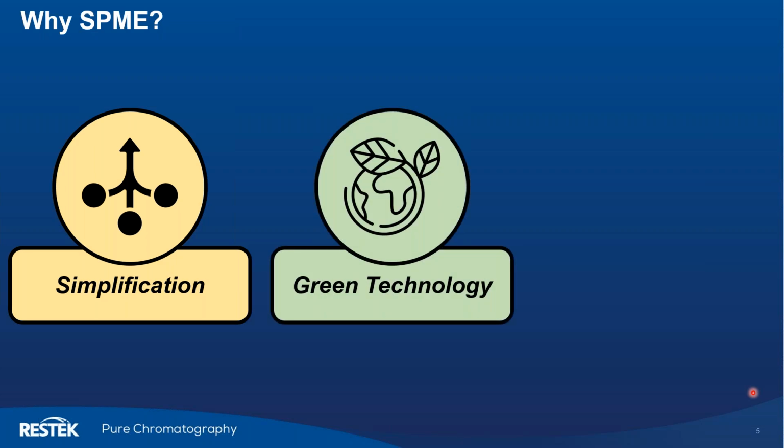The next nice feature about SPME is that it is considered a green technology. We can run headspace off of solid samples, liquid samples. We can directly immerse this into liquid samples, and it also does not require the high volume of solvent usage that is typically used in large liquid extractions or through techniques like SPE.